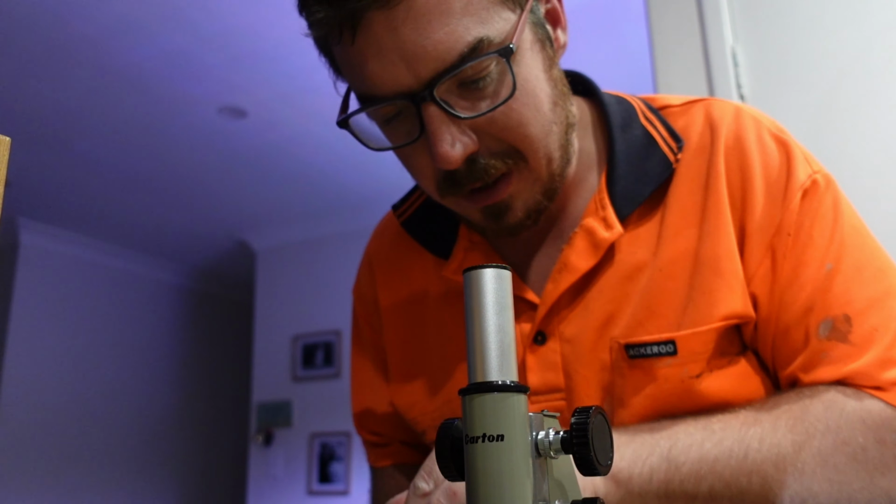And I'll let you guys know if I spot it again. So I think the worm literally dissolved, because I haven't moved the slide and I just watched back the footage on the camera and I've pinpointed where that worm was and I can't see anything. I've got the focus perfect and it's just not there to dissolve. You guys tell me, does the medicine dissolve the worms?